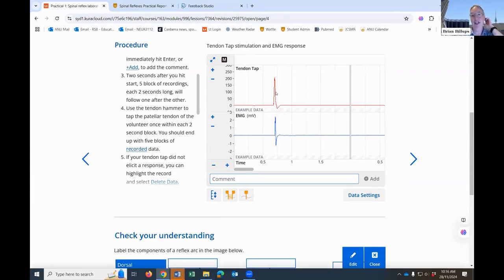loaded. And if you've got a Power Lab and the appropriate software, which ADI will give you access to, you can record your own sample data, and you can put your own sample data in the file in the setup, so it can do exactly what you wanted. And in COVID, this was an absolute godsend, because we couldn't get the students into the lab. I took a Power Lab home, I did the prac with my kids, I got all the sample data I needed, I loaded it all up, did all the conditions, and there it is.